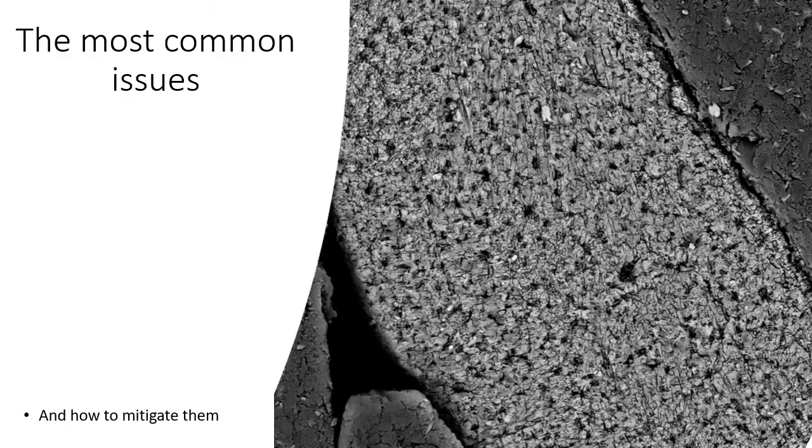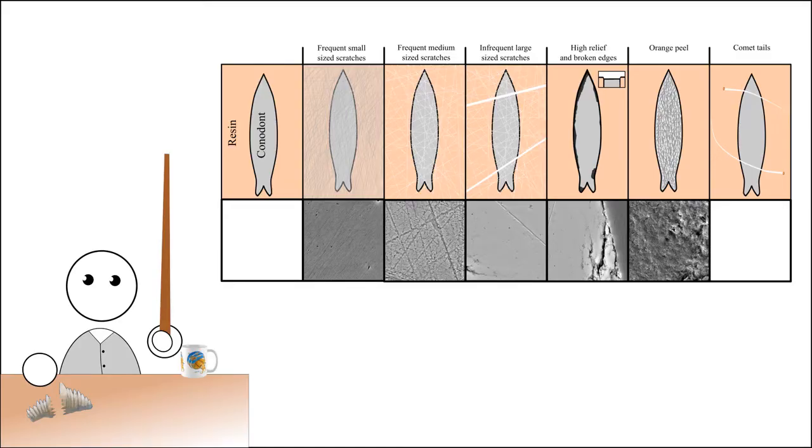Now I'm going to quickly address the most common issues seen while polishing samples. These are the most common surface features that we see. The first is small frequent scratches that are seen on the surface. These are generally quite fine. Especially if you're on the 6 or 3 micron stage, you can easily see these under a microscope. It's just the diamonds doing their job.